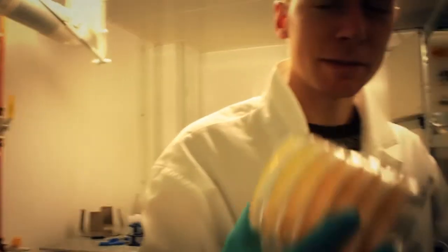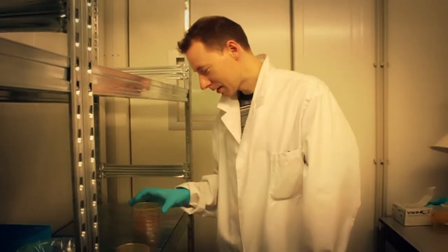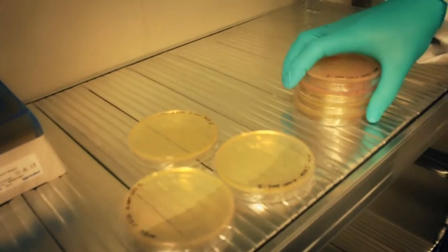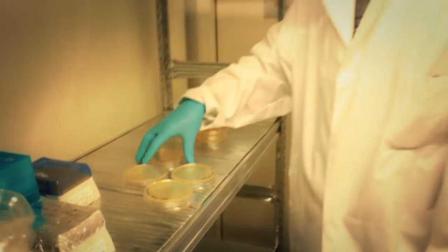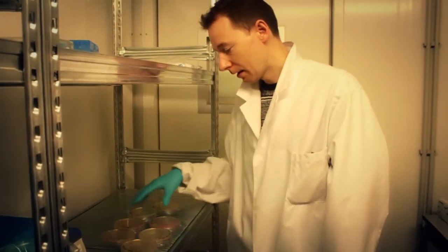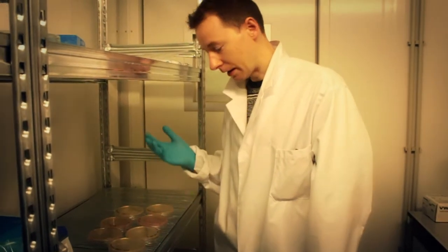So here are the plates and it looks like we got some good results. So normally this is done using a particular plasmid called PUC-19 and that allows you to calculate the transformation efficiency.